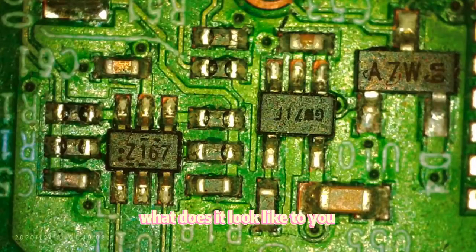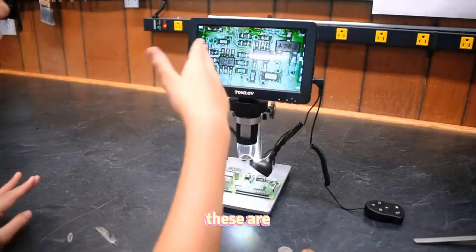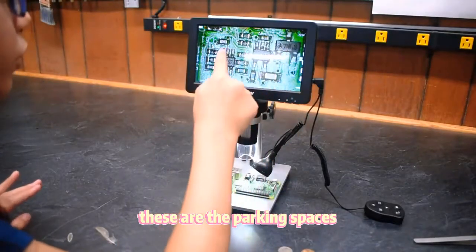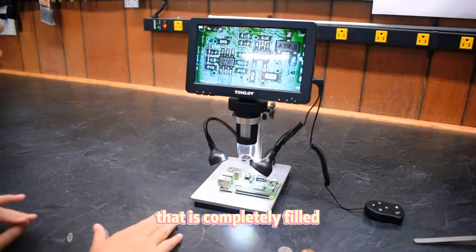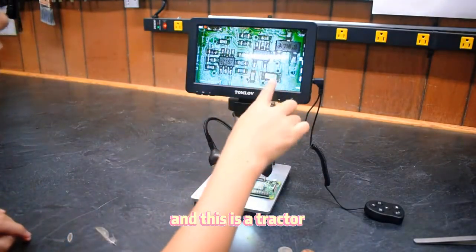What does it look like to you? These are the buildings, these are the parking spaces that are completely filled with cars, and this is a tractor!